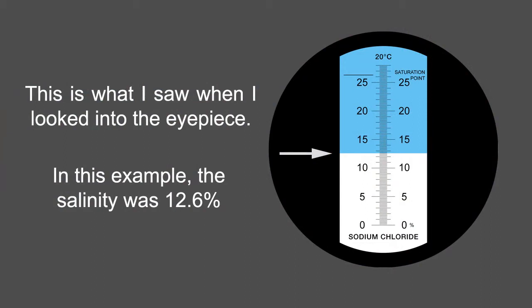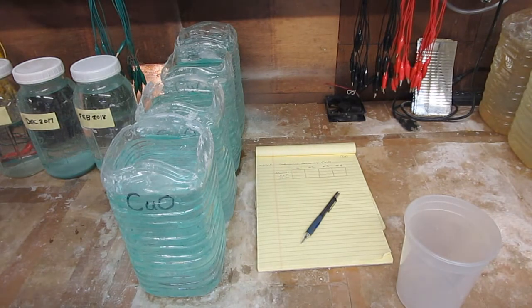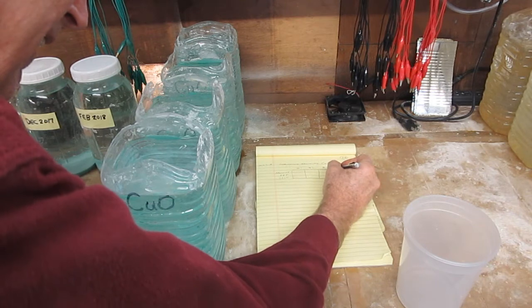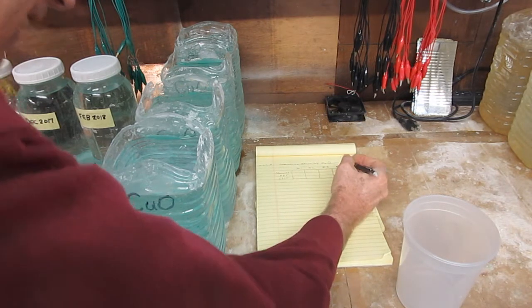This is what I saw when I looked into the eyepiece. In this example, the salinity was 12.6%. Make a note of the reading for reference.